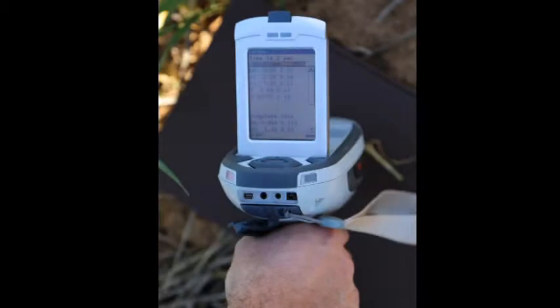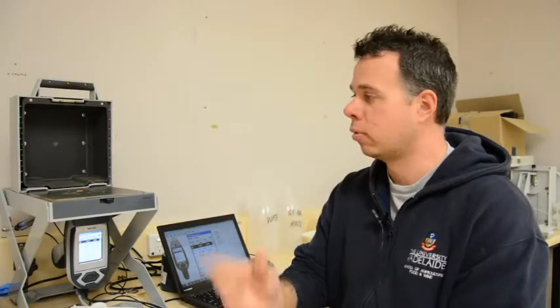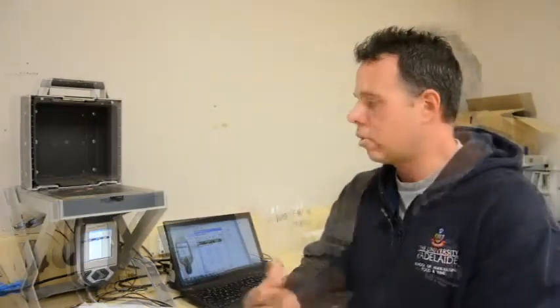Unfortunately, it seems that the water content of the growing plant nullified the signal that you can get back. But once we brought that sample back to the lab and dried it, we didn't need to grind it, but placed it on the XRF, and we got really good calibrations again. In terms of cost, it's going to be quite effective in time. You can push through more samples depending on budgets, and it's good for researchers, I guess, as well, if they're on small budgets, because ICP does cost a bit.